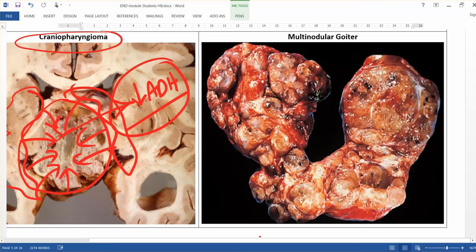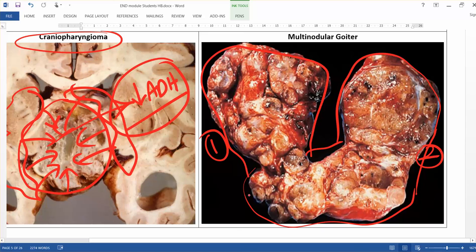This is the thyroid gland — it's not normal, but it more or less maintains its shape with two lateral lobes and the isthmus. However, you can appreciate nodules of different sizes throughout; it is not a homogeneous-looking thyroid. There is a huge nodule here, and within it you can see septa running and creating a lobular pattern.